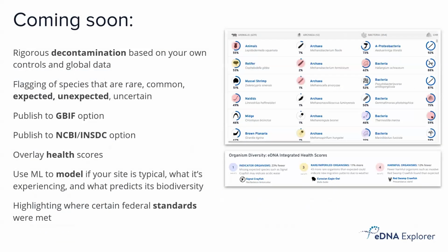And coming soon, you'll be able to do more rigorous decontamination, not just based on your own data, but across global data. We can look at how different DNA extraction kits, what contaminants they provide, if we all are putting our data together. And we can flag species that are rare or common, expected, unexpected, or uncertain.